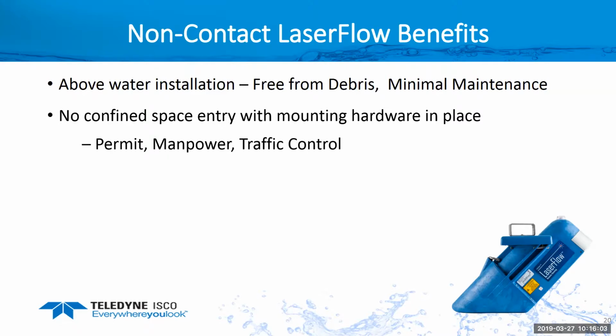Now, I'm not suggesting you only have one person go anytime you're out at a stormwater site anyway. You should always run at least in pairs of two for safety concerns. But the idea is it is low maintenance. As far as maintaining it, you can pull it out and clean it up, put it back in, and for the most part, unless you get a surcharge condition, it should be debris free.